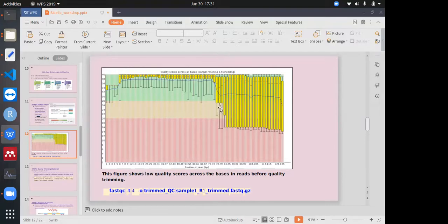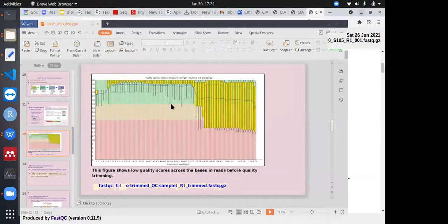You can't really trust if the sequencing machine has worked properly, because this blue line is not giving a good confidence score. I'm not confident here. At the last portion you can see that the error rate is really high. I can't really say that in the last portion the machine is giving me the correct reading.